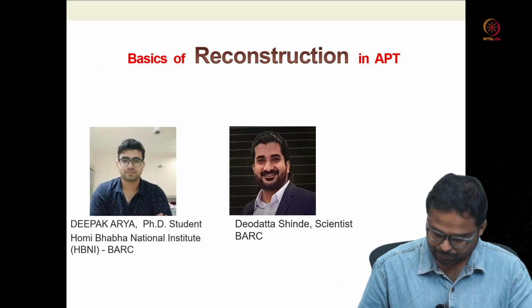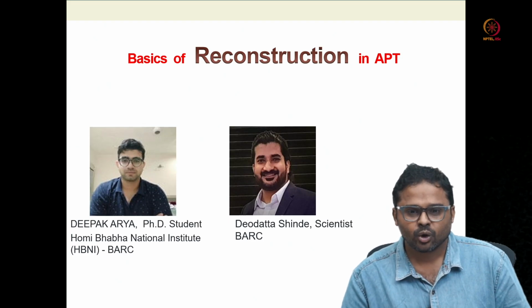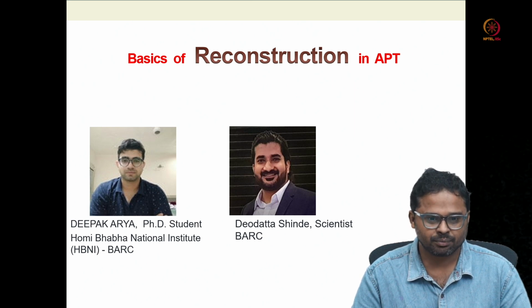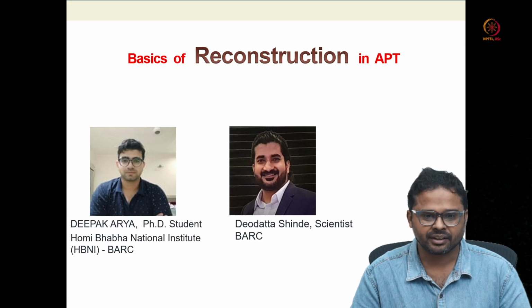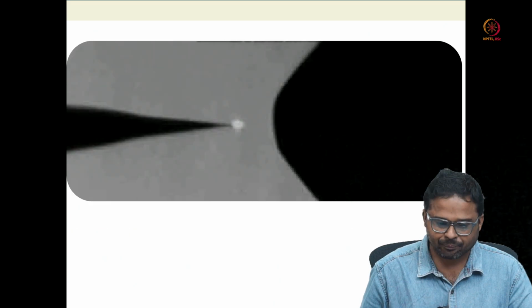Today's slides will briefly go through the information which we are getting from the atom probe data, and how this information is used to determine the reconstruction of the needle specimen.